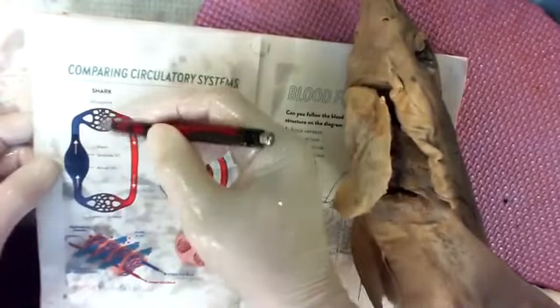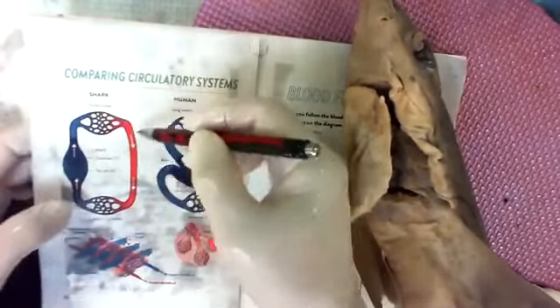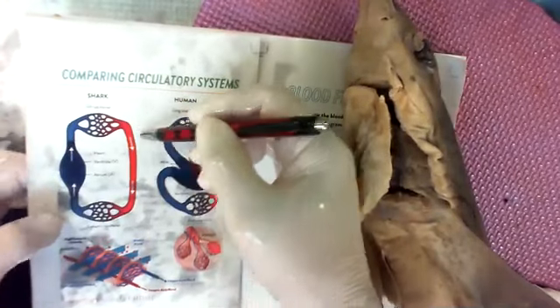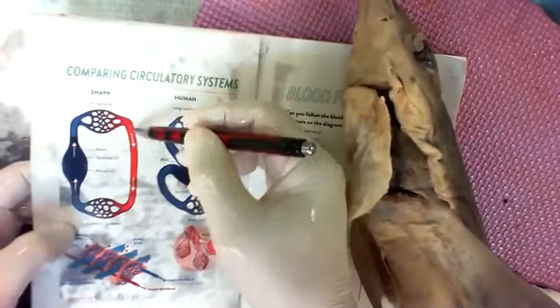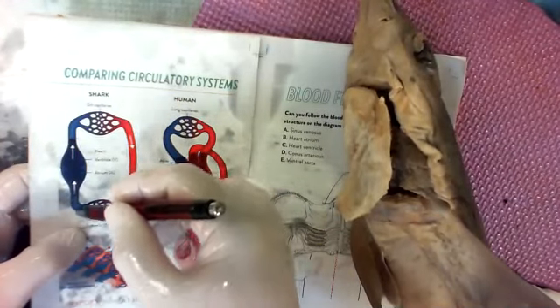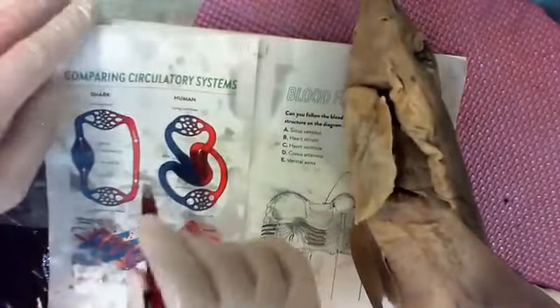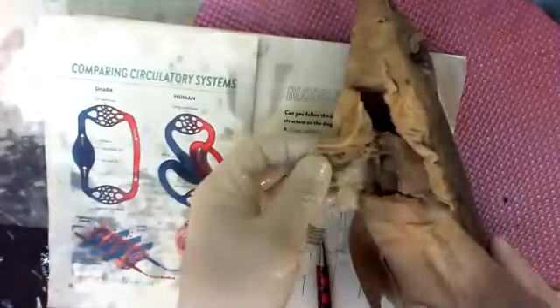So what helps with pushing along are actually the muscles around the gills squeezing, and when the shark's muscles in its body squeeze, when the shark's moving and wiggling, all those things are helping to push the blood back to the muscle, drop off oxygen and bring it back. Circulatory system, always in a circle. It's fast and it's efficient, and it works by blood vessels.